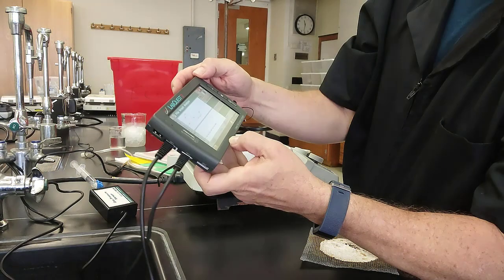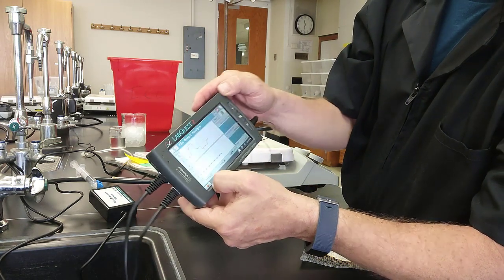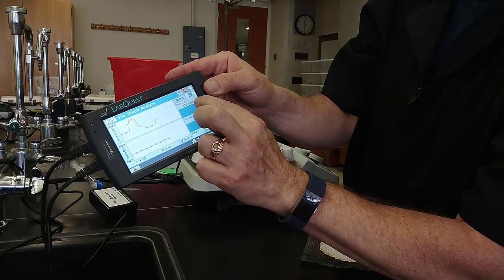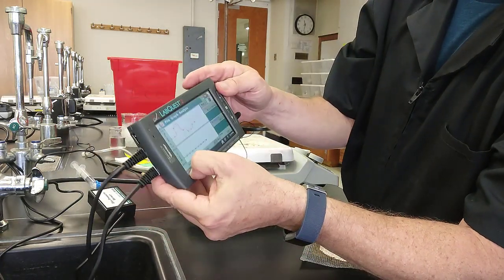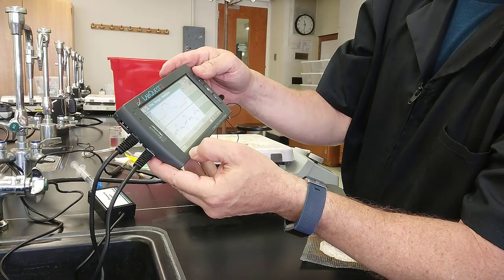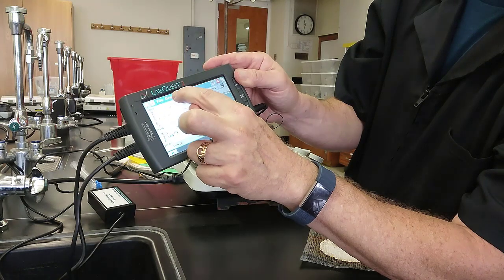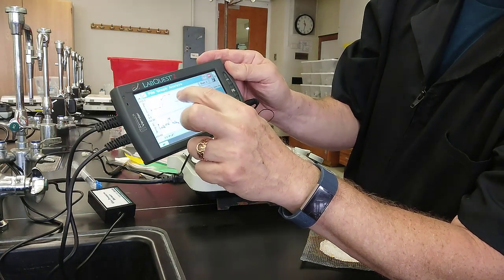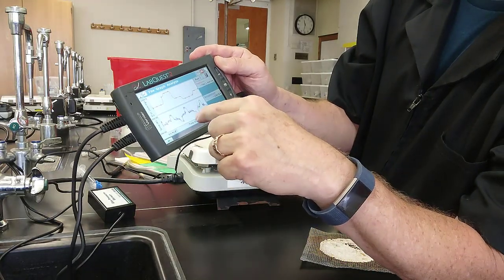So now, if we go to stop our run, we could have just read the numbers off of the screen here, the pressure numbers. But if we go stop our run and then change our reading, instead of the graph, we put it into the data mode.